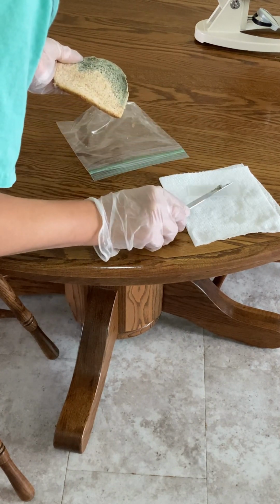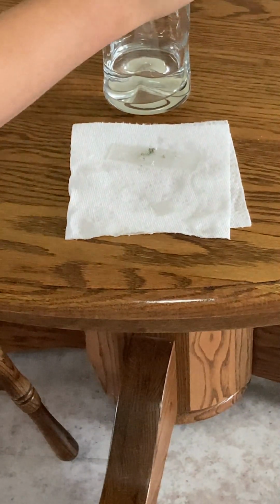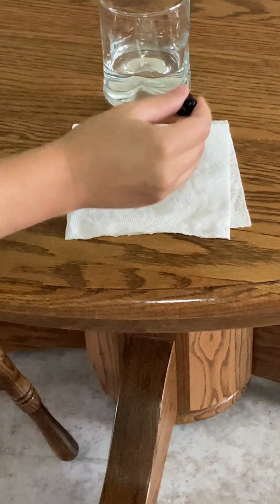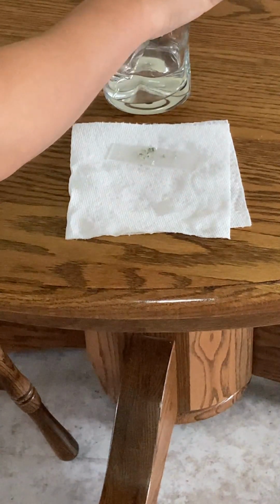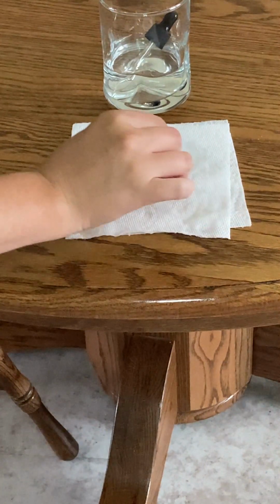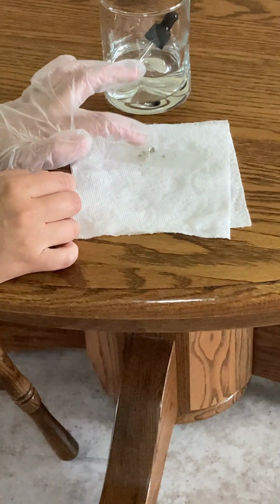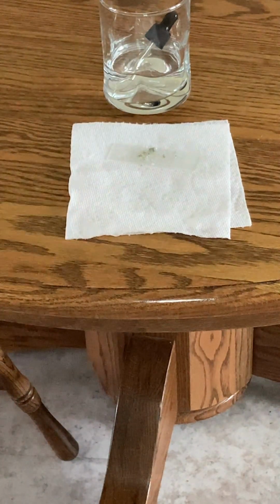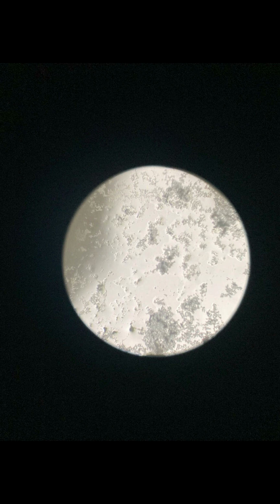I will place a small amount of the mold on a microscope slide, add 1 drop of water and a cover slip, and then look at it with all magnifications under my microscope. All right, and here's what I saw. The smooth round structures in the picture that I took here are the mold spores. You definitely do not want to breathe these guys in.